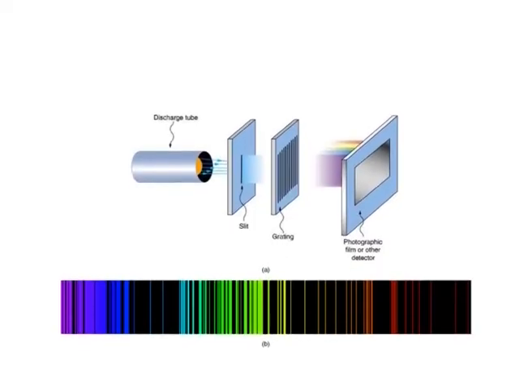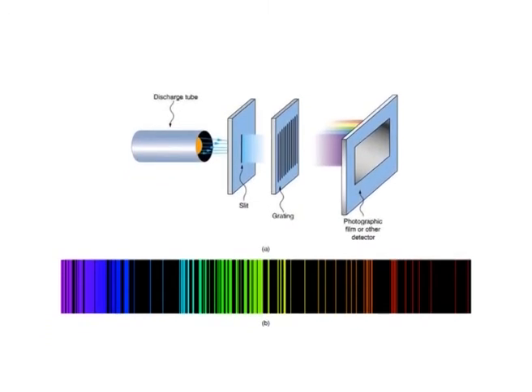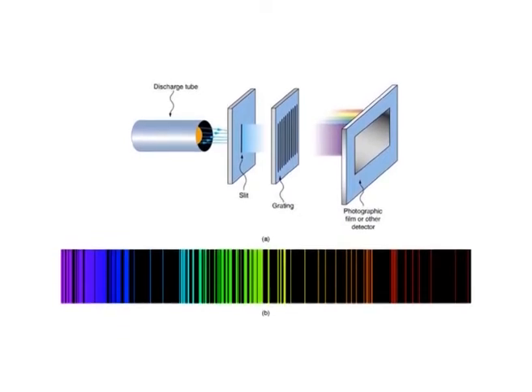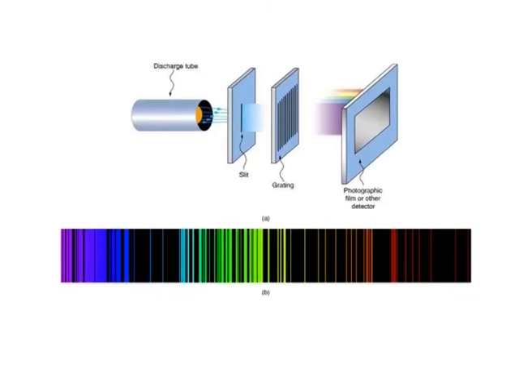As the emission spectrum emerges from the source, it is focused onto the spectrophotometer's entrance slit, where it is dispersed into its component wavelengths. The optical elements permit site selection within the source's discharge and thus eliminate the need to move the entire source assembly.